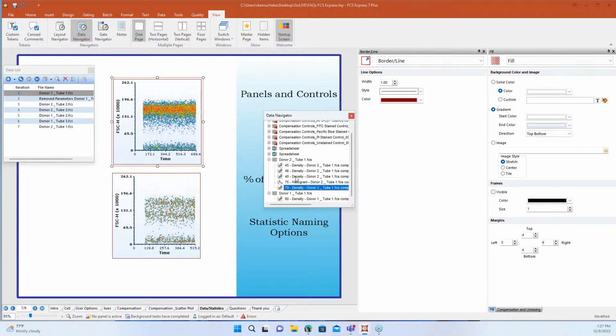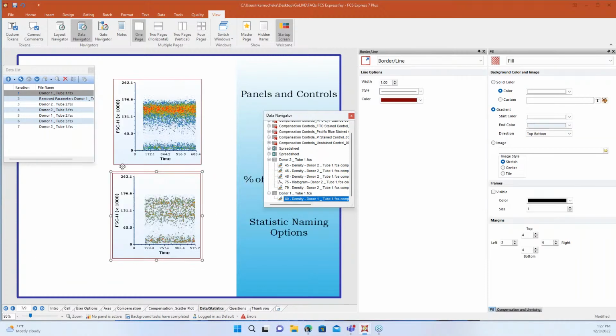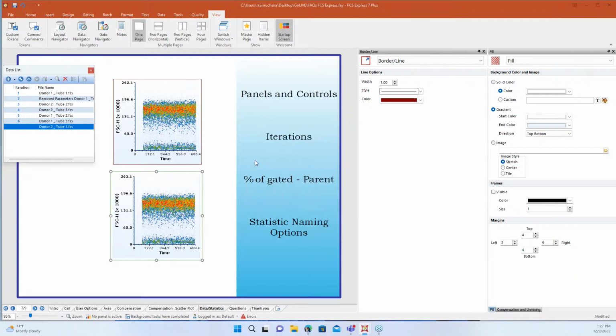So when you highlight anything, you'll see that it will highlight the plot, so it will also move you to different pages. But when I'm here, I'm like, okay, so yep, that's the guy that I need to change, and I need to change it to this donor tube 1. So I can just simply drag and drop here. Now that's resolved. All my iterations are happy. They're blue and ready to go. I can use my batch processing tools.